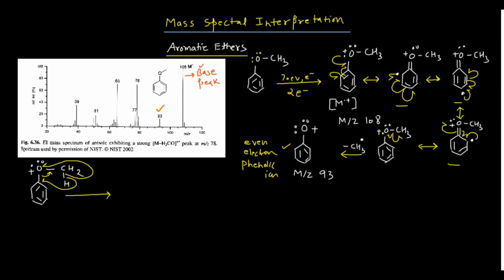So now what you have done here, you have completely broken this bond as you have shifted this electron pair. 1 odd electron was there and 1 is coming from here. That means this entire species is neutral now, and since this species is neutral, you can write its structure as oxygen double bond CH2. I hope it is quite clear, right? Single bond was already there. 1 electron pair is coming from here. So carbon double bond oxygen is here. Of this CH2, one of the hydrogens is shifted here. Okay. So you have removed this formaldehyde molecule from here.